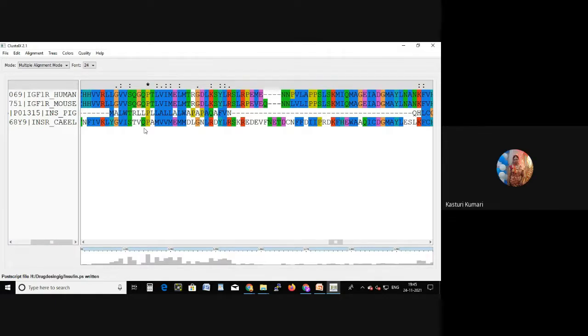But it's showing the same color, no? Same color represents the same. That's the thing, it is also similar, but you have to understand based on the representation of the identical symbol. So star mark. See here also the same color is available then. Yeah, I mean it's showing the same color for the 4 organisms. Then what is the meaning of that? That's why sometimes they are very similar. That's it. That particular region has similarity.